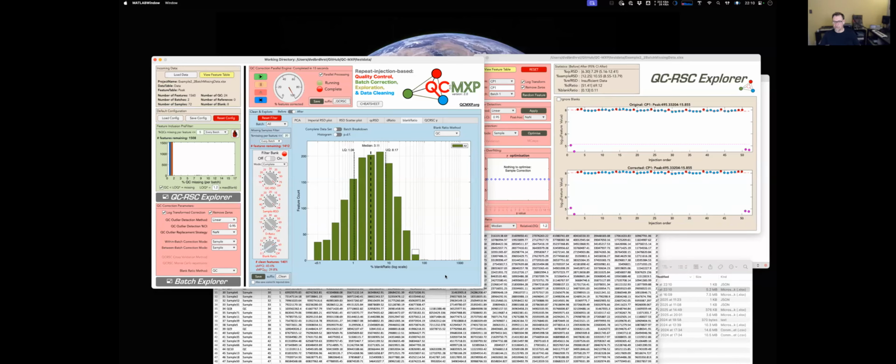I tend not to worry too much about the blank ratio because usually features that have got a terrible blank ratio fall out of the mix when you do the statistics anyway. But it's always good to see, just to see how good your data is. Sometimes you'll see a data set where almost everything has a less than 10% blank ratio, in which case you really have got high signal, but not always. And I wouldn't say that something being above 10% is necessarily bad. Does that answer your question?